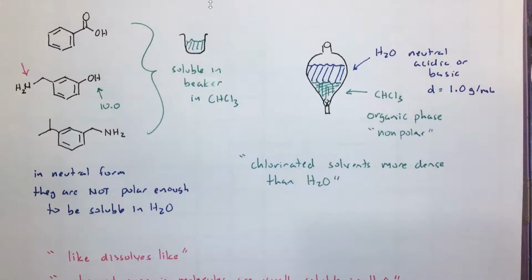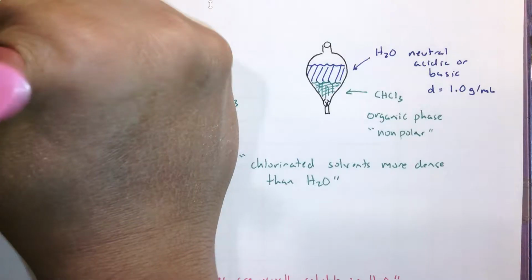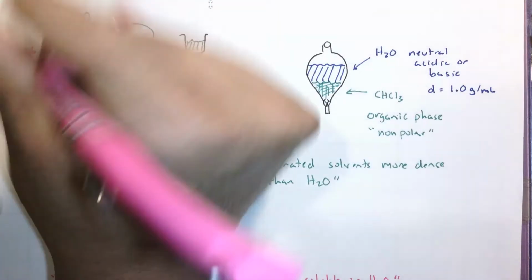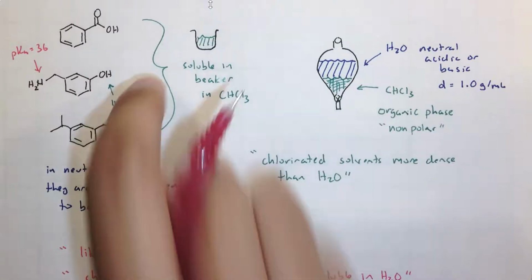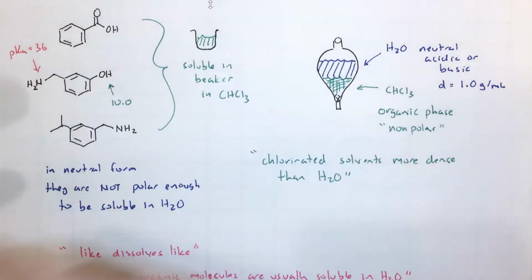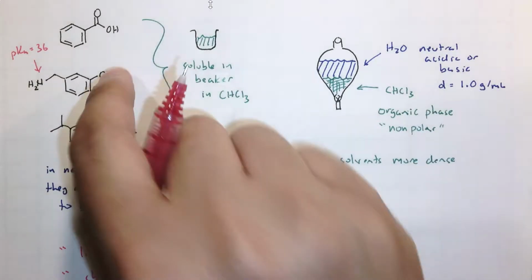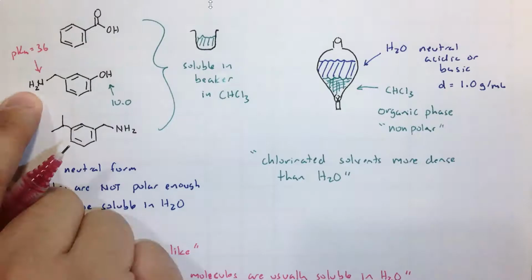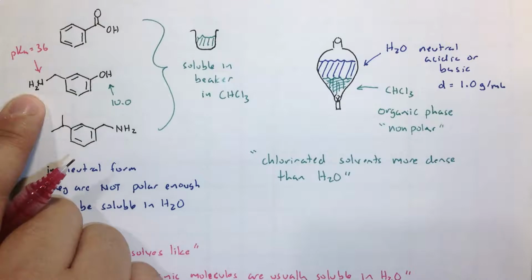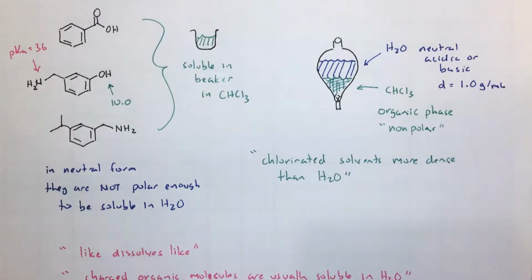It's acidic, meaning that you could remove the proton, but the pKa is super high. The pKa equals 36. So when you mix this molecule with some base, the base is more likely to grab this acidic proton, not this acidic proton. Okay. Actually, this is basic. We could get this charged by adding hydrochloric acid, and we're going to do that in just a bit.